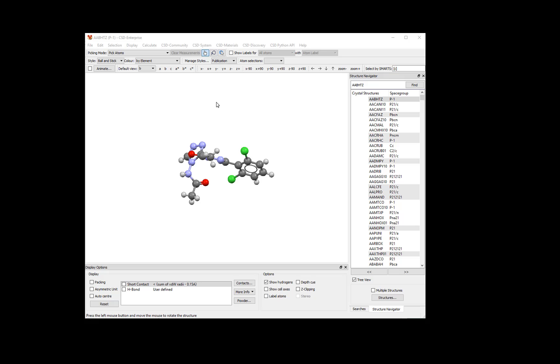Open Mercury by clicking or double-clicking on the icon. Once the program is open, you will see a list of entries in the Structure Navigator on the right-hand side of the window.